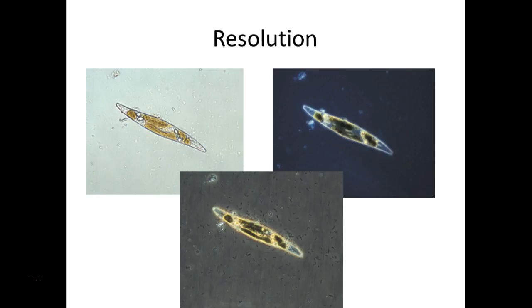This is a problem we're used to nowadays too, though, right? If you take a picture of somebody, especially with your smartphone, can you blow it up real big? Pretty big, because it stores a lot of information, so that you have enough information that you can make it bigger. But if you had one of the old ones, could you blow it up? Not very big. It got blurry. And that was an information storage problem.